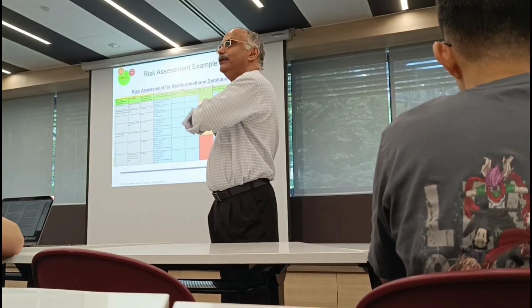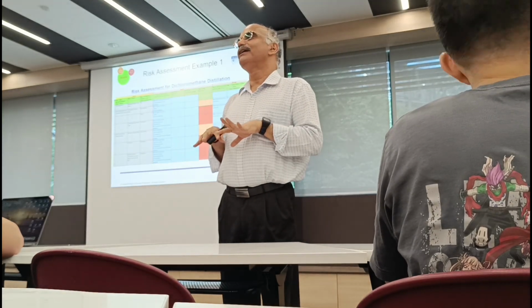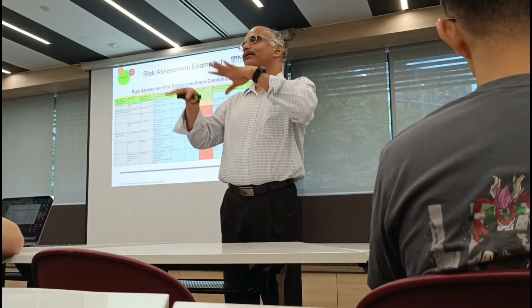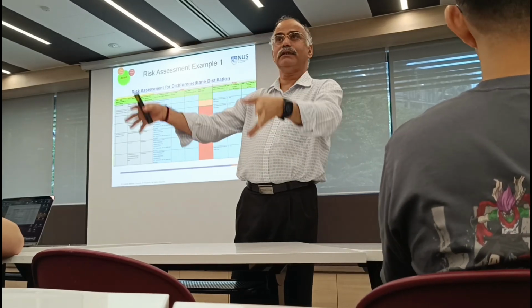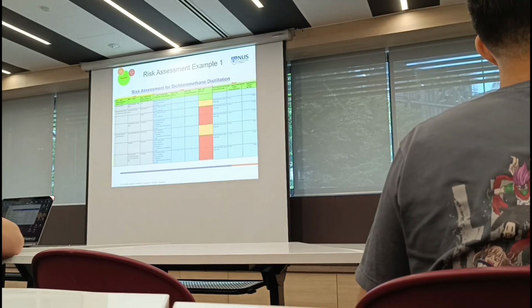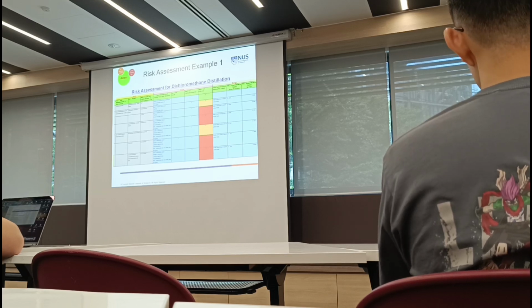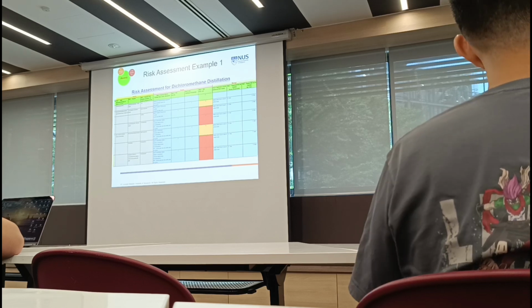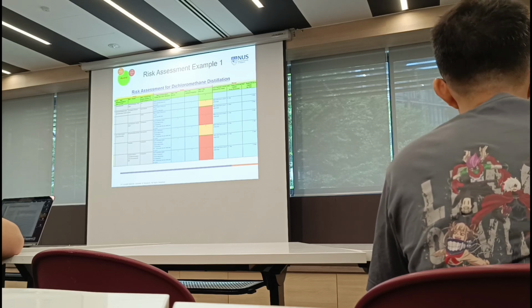So now if you put 1 and 2, and you do that process and get into danger, what will happen? You will get into big trouble with our safety auditing team, right? They will say, oh, you are not serious, you did not understand how to do the risk assessment. You should have talked to the safety lead or a professor to do it properly, right? So that's what you must avoid, because if you do it properly, then even if something goes wrong, you are protected. They will not blame you, right? But if you do it really not very well, you fill up these things and give it to them, then of course there will be a problem, right? So please pay attention and do it properly.